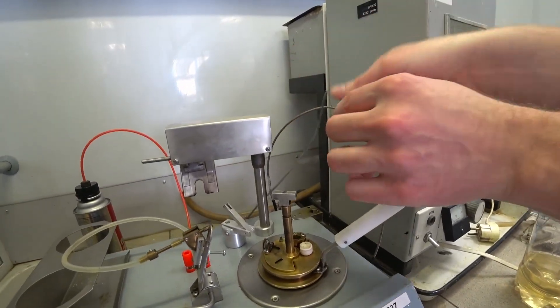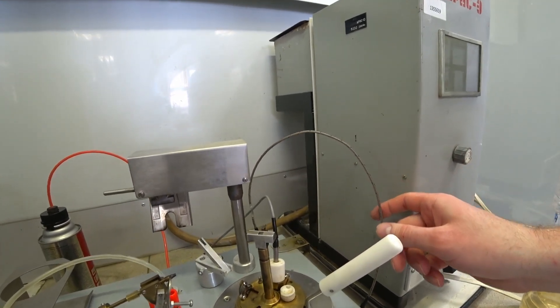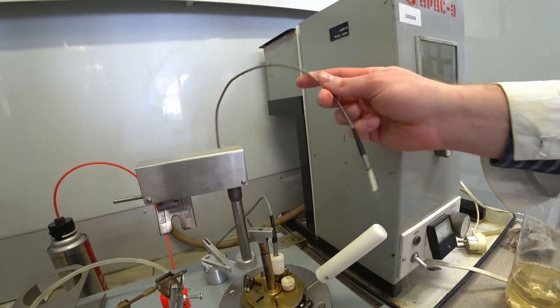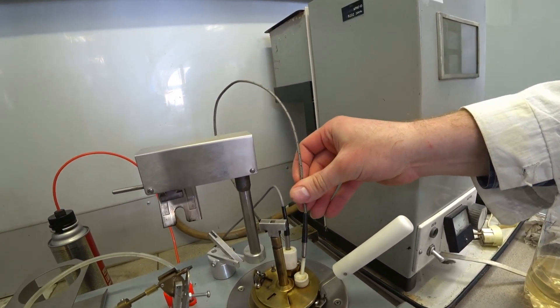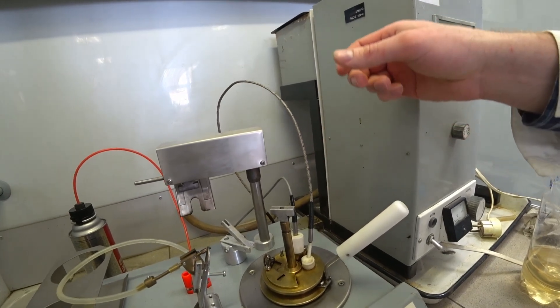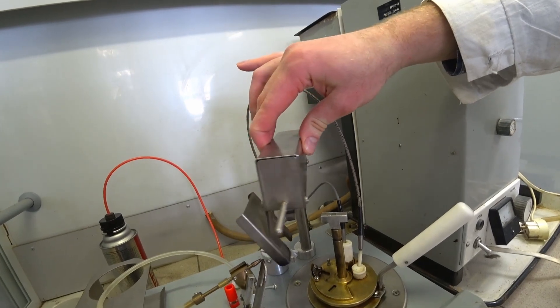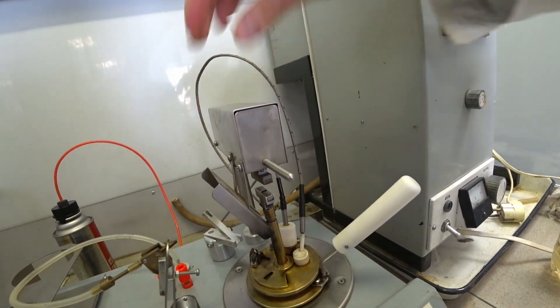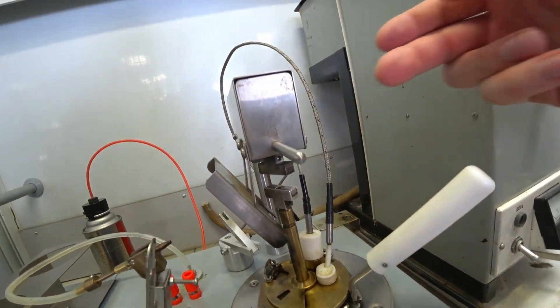Then we have to set the thermometer — this is an electronic thermometer which can measure the temperature in the closed cup. And this is the flash sensor, which detects whether the vapor has been ignited or not. Then we close this onto the arm, which is for stirring the fuel itself.